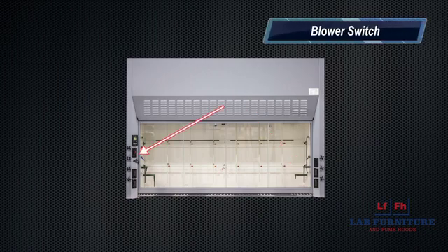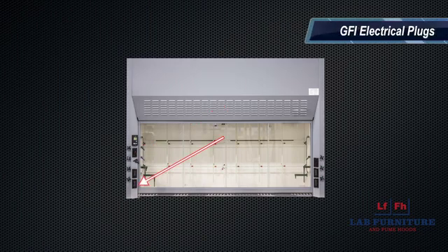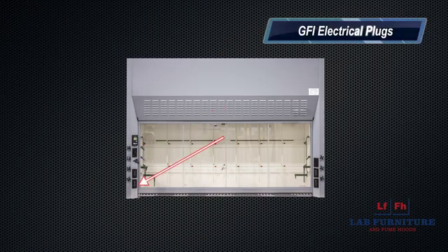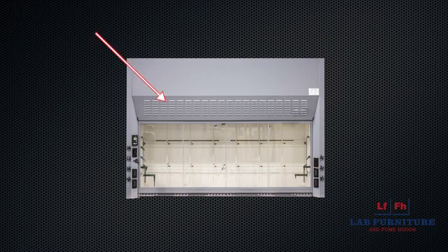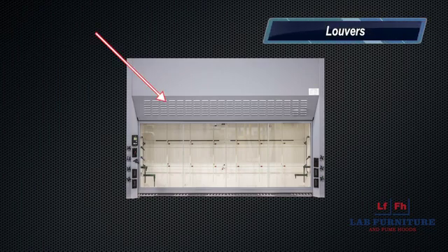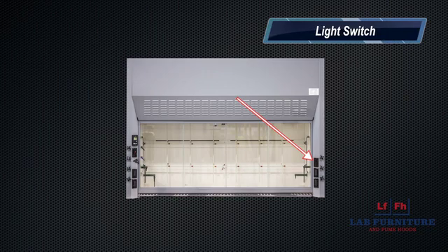If your hood has a blower switch, this will turn your fume hood on and off. Fume hoods have several GFI electrical plugs for using with equipment. Louvers are provided for bypass on constant air volume hoods only. The light switch is connected to your built-in lighting in your fume hood.